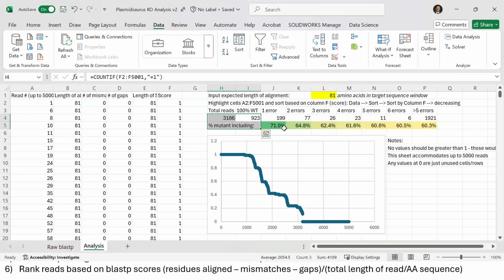So this is not giving me something that's very quantifiable due to this uncertainty here with the nanopore sequencing, but it is giving me a rough view of if I need to go back and change my KO settings, okay? And in this case, it looks like we could do better, all right? So go back, change something, do this again, and see if all of these numbers go up, right? That would be a good sign that you're optimizing your protocol.